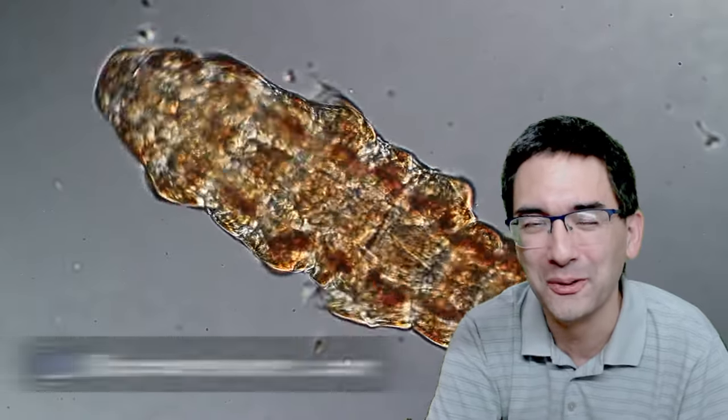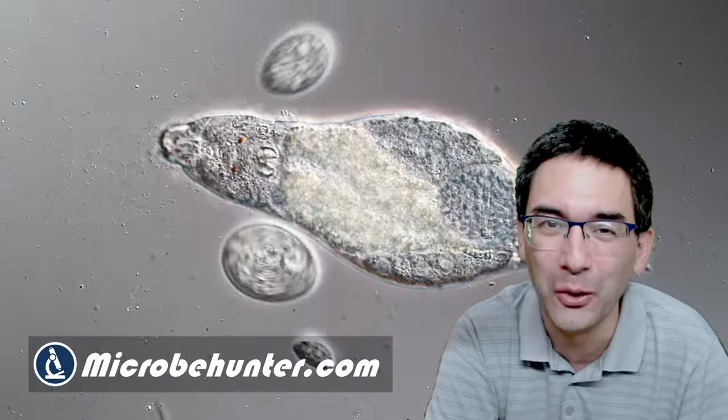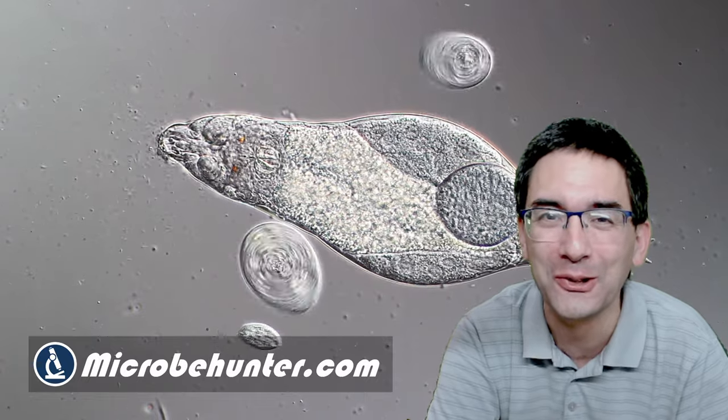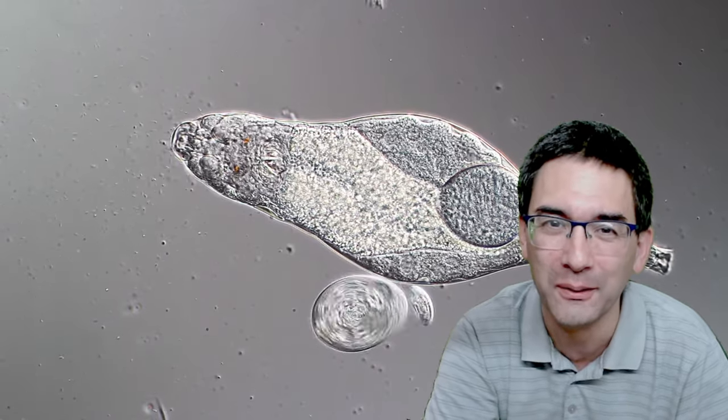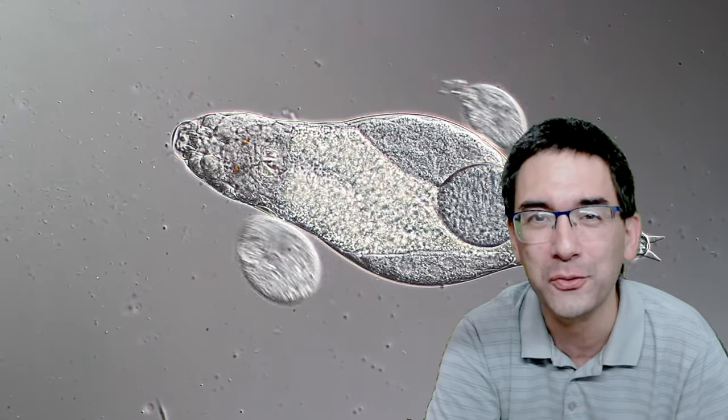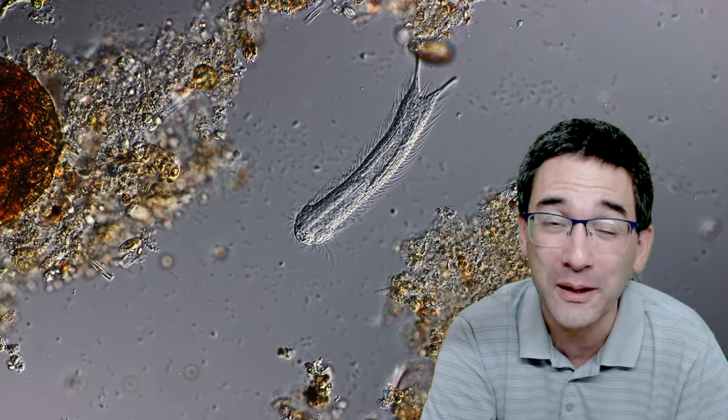So hi, hello and welcome. MicrobeHunter here again, and of course we all would love to make videos that look this great, like for example this rotifer over here with a few ciliates swimming around or this gastrotrich.